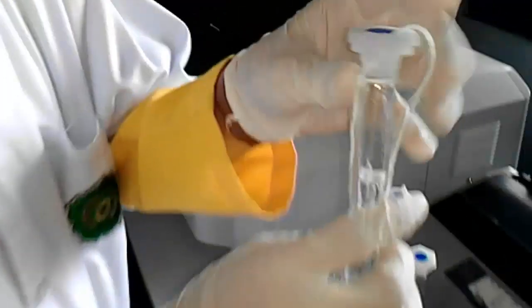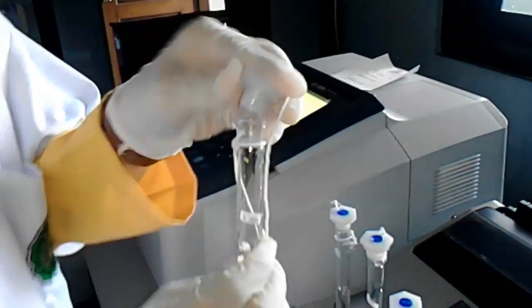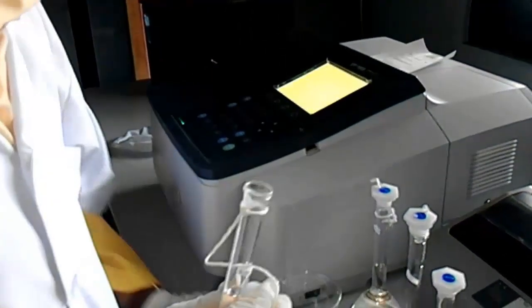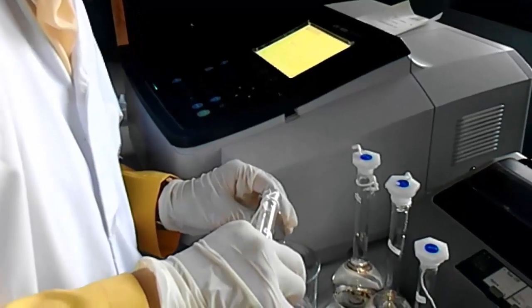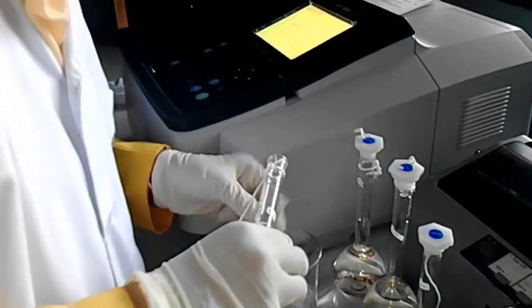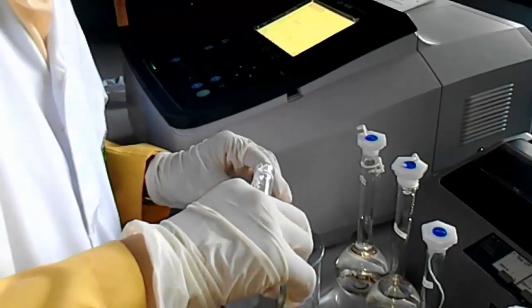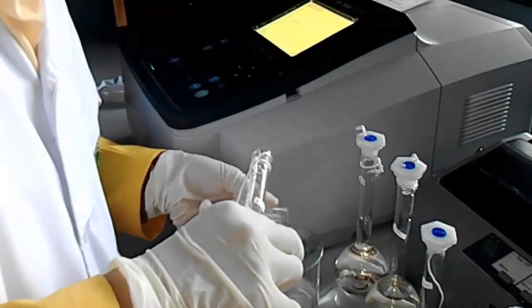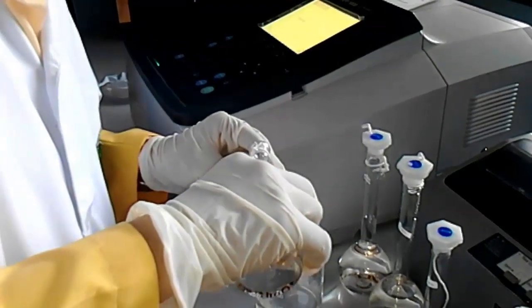And this is the 16 ppm standard of chloramphenicol. Wash off the cuvette with 16 ppm standard of chloramphenicol. Then pour it into the cuvette.